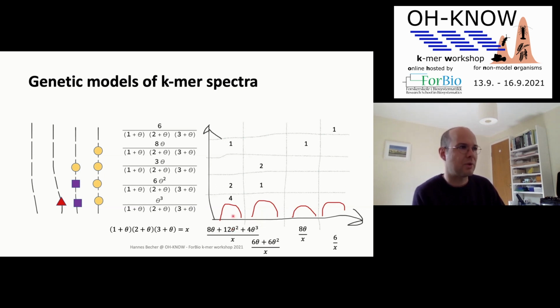And it's also going to have more K-mers in it than the third peak, because 8 theta is going to be smaller than 8 theta plus something that's positive. We can't tell whether it's taller or not than this last peak here, because we don't know what theta is, it's a variable at the moment. So we don't know if this peak is larger or smaller than 6.